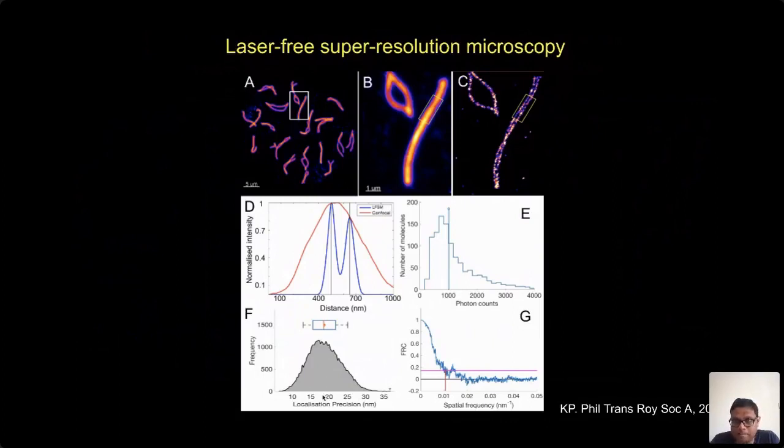And I will come to the signal density, right? So if you have a lot of signals, you can actually even improve the resolution. But I will come to this point again in a bit. And if FRC is very popular these days, so we are hitting a 90 nanometer FRC resolution. And this is no filtering of data. This is just the raw data.